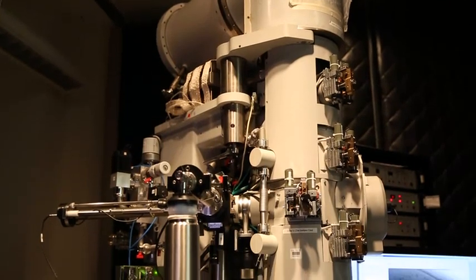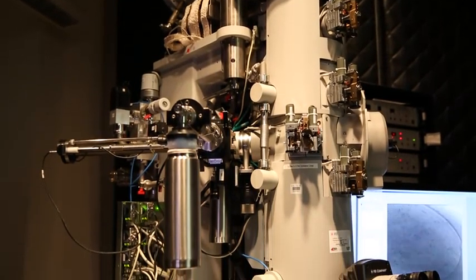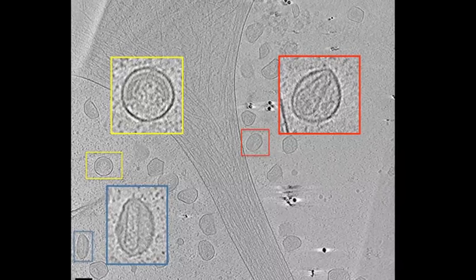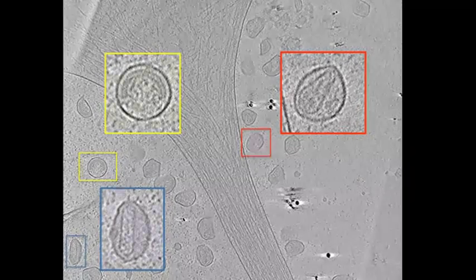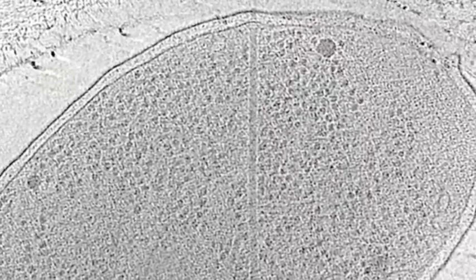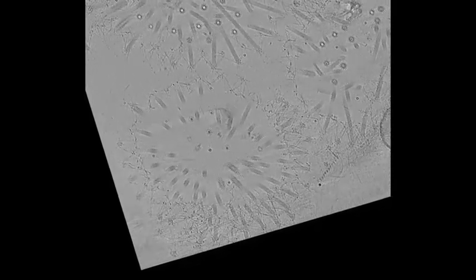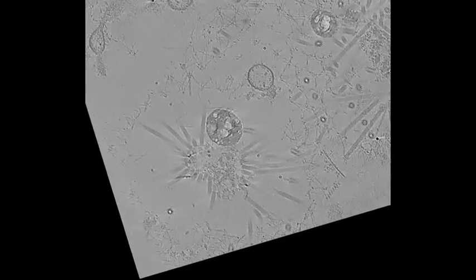I'm a professor of biology at the California Institute of Technology and an investigator of the Howard Hughes Medical Institute. One of the most important things we do in my lab is cryo-electron microscopy and 3D electron microscopy. Cryo-EM allows biological samples such as macromolecular complexes, viruses, or even whole cells to be imaged in a near-native, frozen hydrated state, sometimes to near atomic resolution. Imaging macromolecular complexes by cryo-EM often leads immediately to dramatic new insights about their structure and function, especially when they're imaged in their cellular context.